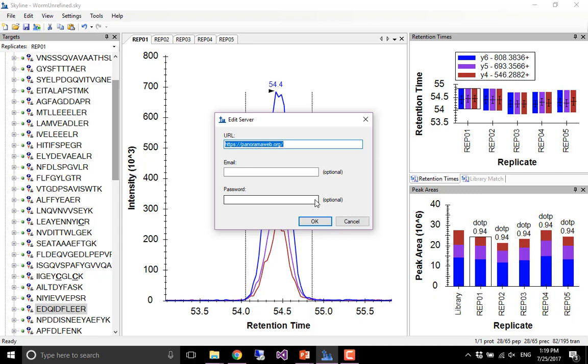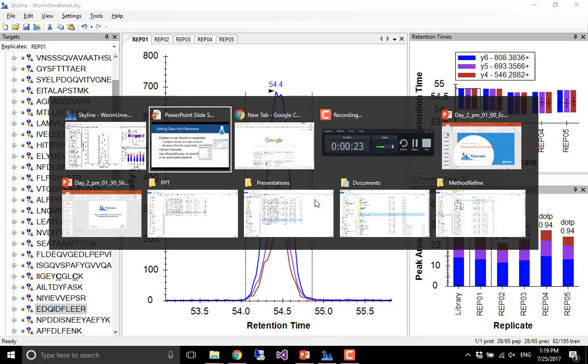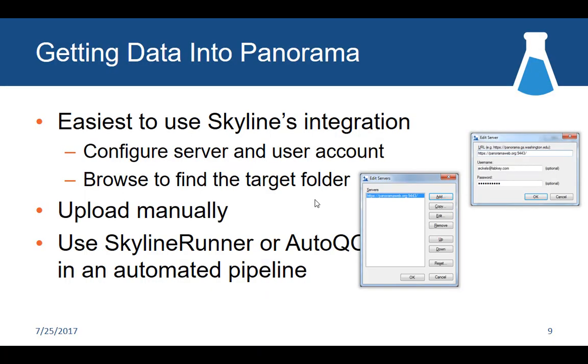And then the next step is to tell it where in the server, basically what folder you want to push it into. It'll connect to the server, figure out what the folder structure looks like, and say, drop it here, and it's got some nice capabilities now. Vigisha added that if you're uploading a new version of that same document, it says, well, last time you uploaded it here, do you want me to drop it in the same spot? And then, like I said, it'll link that together, connect it with the previous version. But since we're not quite set up, I won't go through that, and Vigisha will take it from there next time.